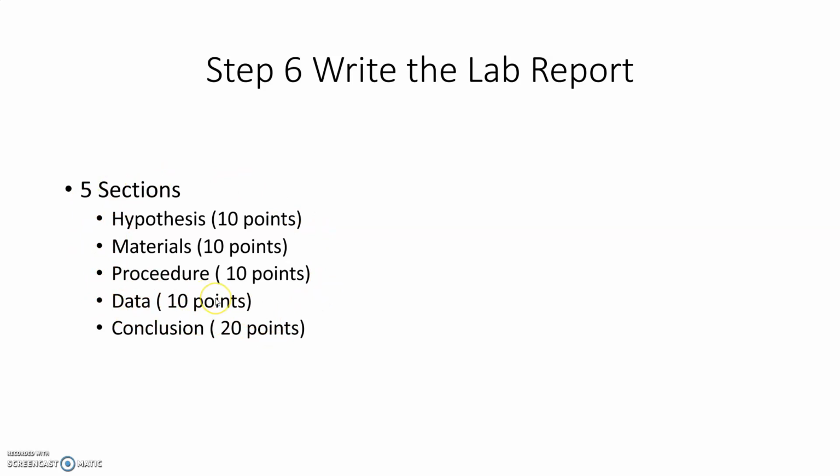Basically, just uploading pictures onto the paper, and then the conclusion is just writing up what happened, right? And the conclusion a little bit more. You're going to have a little bit of leeway in there as far as the creativity of the experiment. How well you explain. I don't want you just to point and say, hey, picture 5 shows there's growth, and picture 6 shows no growth. State your hypothesis, explain whether or not you think that was correct or not, and then explain why you thought it was correct or did not think it was correct, the reason behind that.